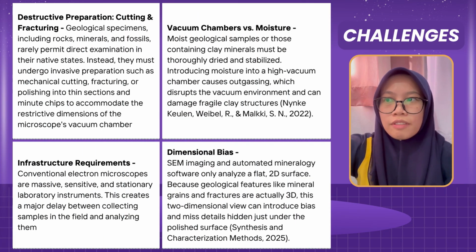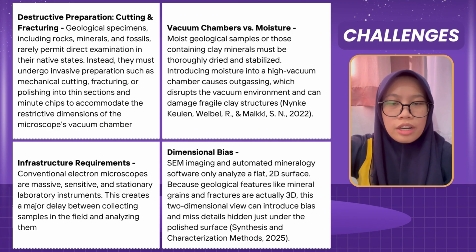So, four challenges. First, destructive preparation, cutting and fracturing. Geological specimens, including rocks, minerals and fossils, rarely permit direct examination in their native state. Instead, they must undergo invasive preparation such as mechanical cutting, fracturing or polishing into thin sections and minute chips to accommodate the restrictive dimensions of the microscope's vacuum chamber.